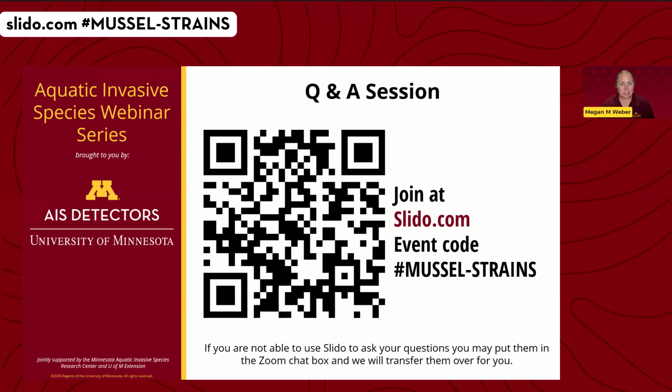All right. Next question is wondering about potential future expansions for your work, and they're wondering if you're thinking about replicating this to also look at things like quagga mussels, and wondering also if the existing SNP panel could identify unique lineages of the quagga mussels.